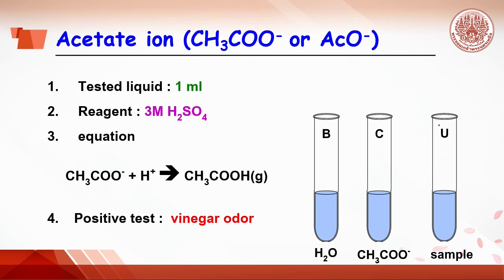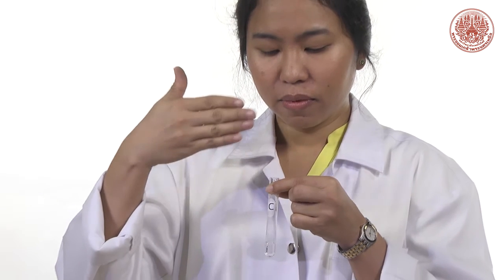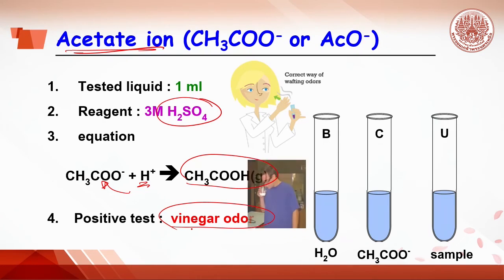Here is an example of spot test for finding acetate ion by adding tested liquid like water, acetate ion and sample. Then add the reagent sulfuric acid. As sulfuric acid is added, it reacts with acetate ion to get acetic acid, which has a vinegar odor. In this test, please be careful when testing the odor by wafting odor by hand. Do not directly smell the odor.